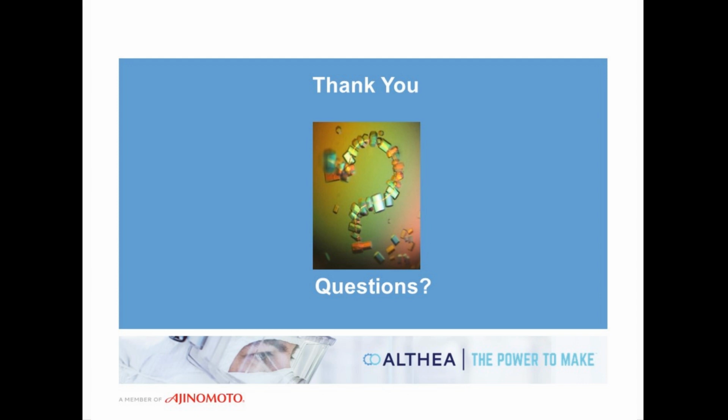It's a great question. It's definitely always something that we think about. Our imaging system has UV imaging capability, so the first thing that we do is test with that. If we do have some doubts from our UV imaging, then we'll also use Izit dye, so we'll dye the crystals. And then we'll even use a poke test, so we'll manually poke the crystals and determine that way as well.